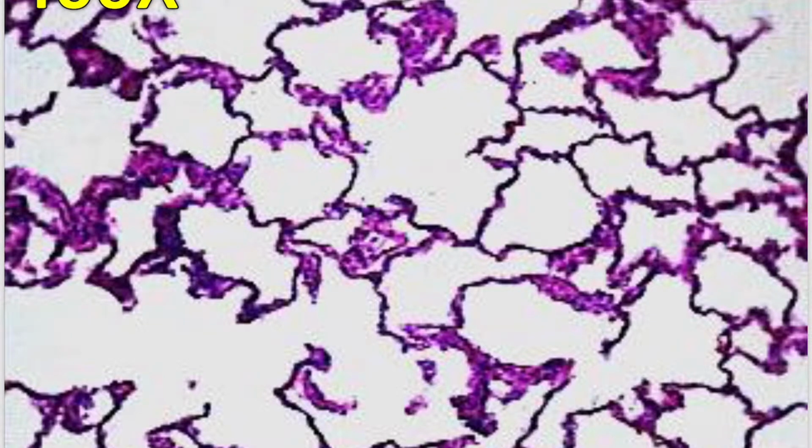This slide right here is actually an alveolar sac taken from lung tissue. So what you're actually seeing here is not cells. This blob that you see, I'm going to point out this blob right here. Hopefully you can see what I'm encircling. I'll do it one more time. This blob right here is not a cell. As a matter of fact, all that you're seeing in this picture, all the deep fuchsia color, that pink color, that is the cell. So you're seeing lots and lots of cells, but you're also seeing lots of air.